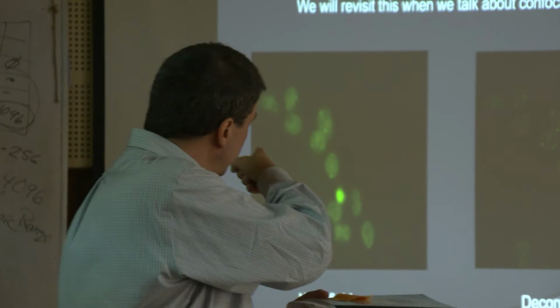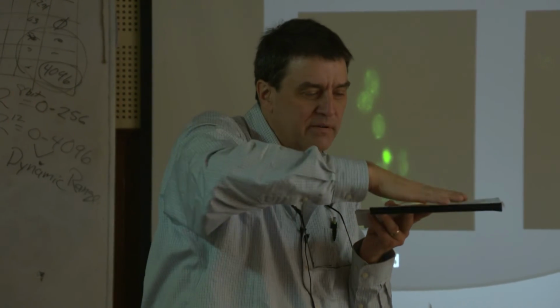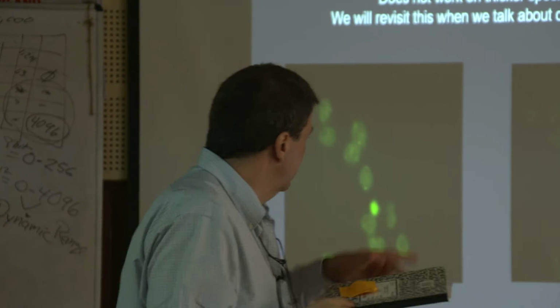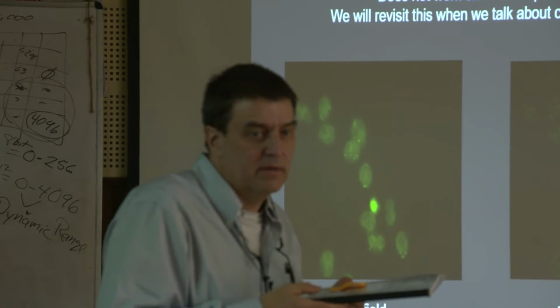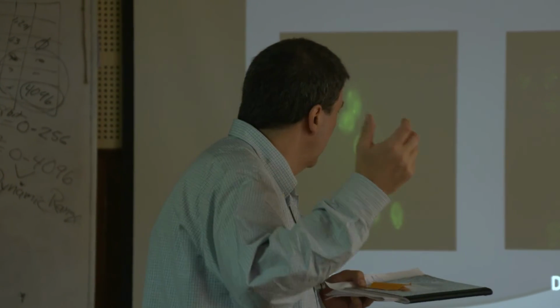The deconvolution software here uses all this information from above and all this information from below on a wide field image to determine what this should be. Okay, so that's pretty much the gist of the difference between confocal and wide field.